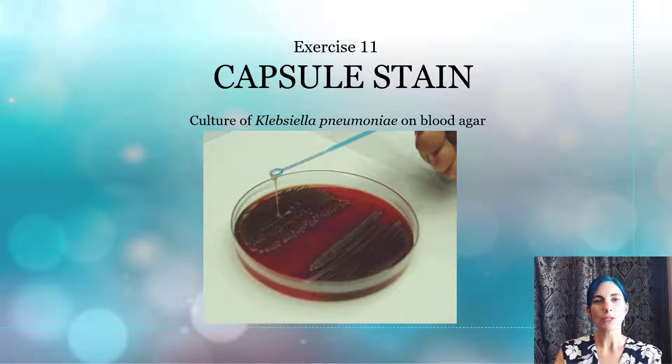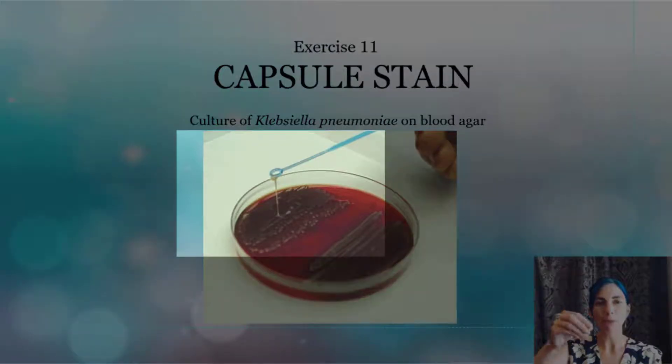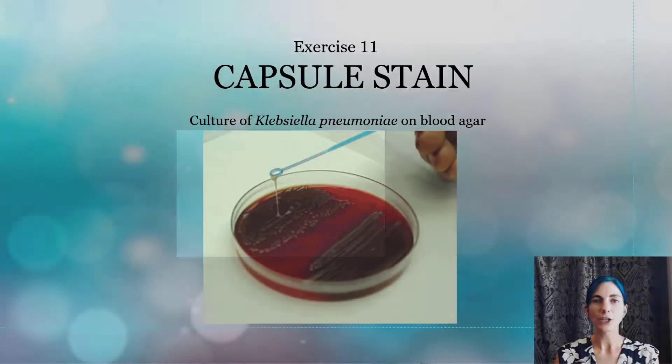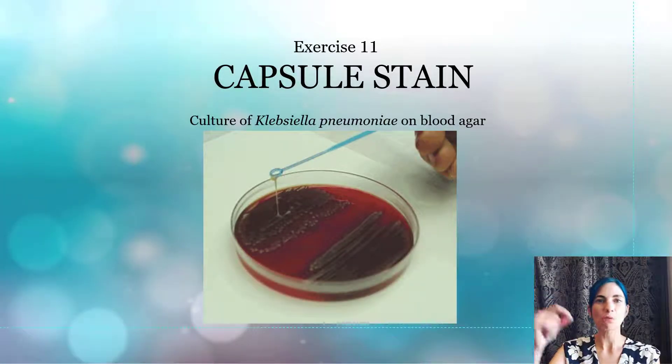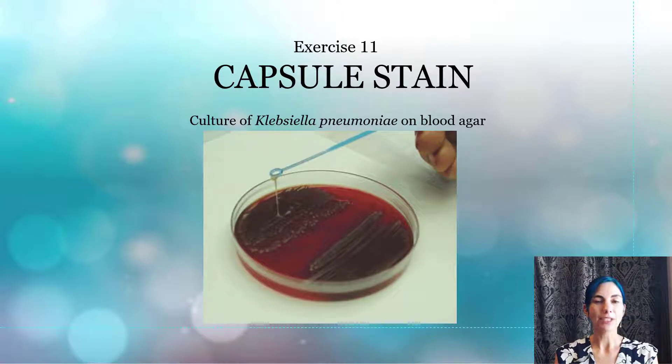So if you take an inoculating loop and you kind of pull out on one of those colonies you can see that there's actually like a goop string in there and that's from the capsule. So capsulated colonies tend to be very goopy and slimy looking but that's not a surefire way to determine if something is in fact capsulated.